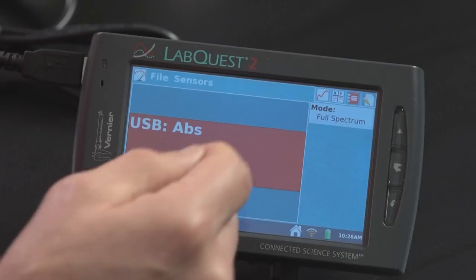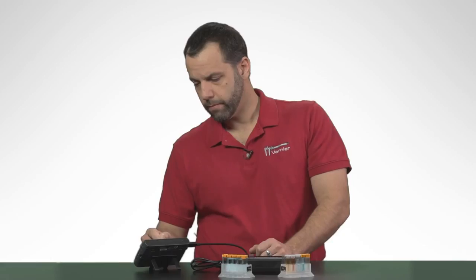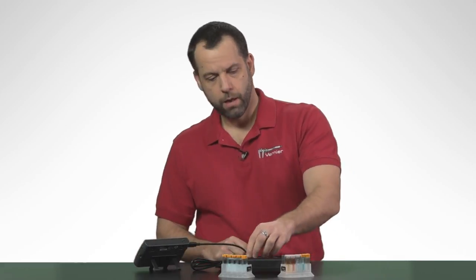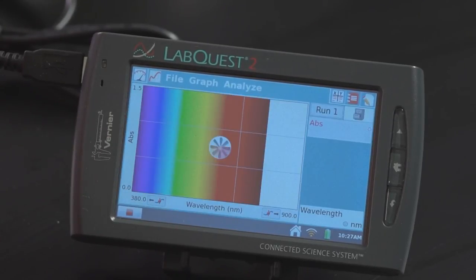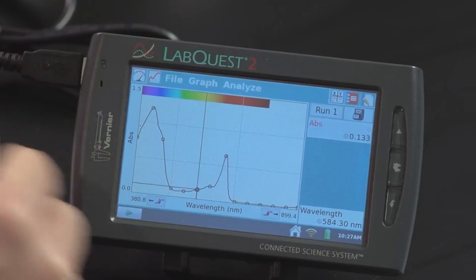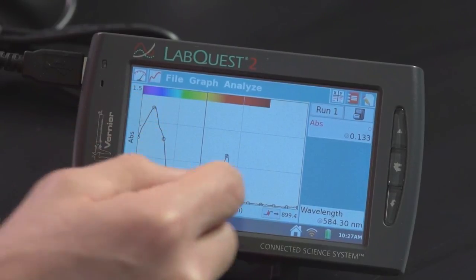I'm going to put that in the spectrometer and recalibrate again. Remember the device is already warm, so once the screen comes up I can skip the warm-up. I'm going to finish the calibration and select OK. Now I'm going to take my chlorophyll extraction, place it in the spectrometer, hit the Collect button, and voila! Let's take a look at it — I'm going to double-click on the screen again. You can see right here, this is really nice. This is exactly what most teachers want to see: chlorophyll absorbs a lot in the blue and a little bit in the red.